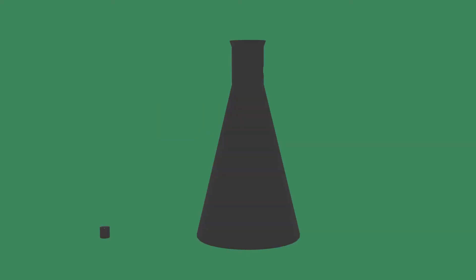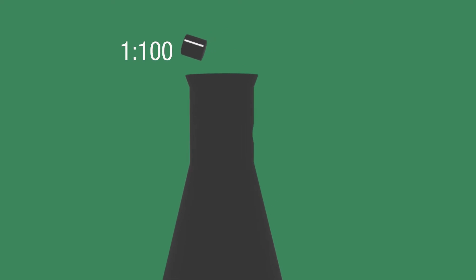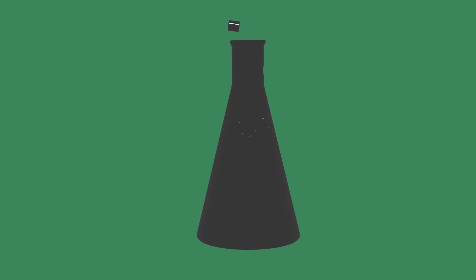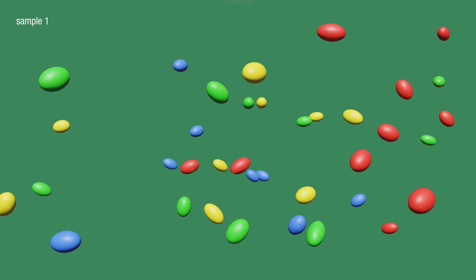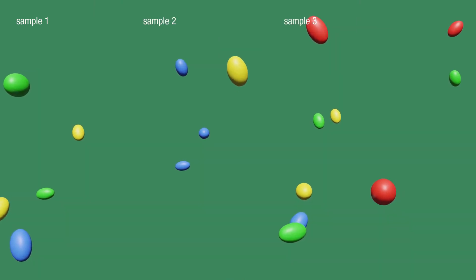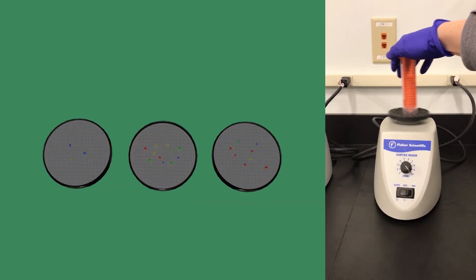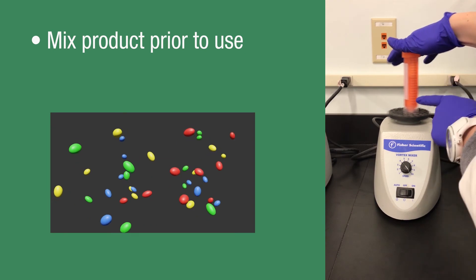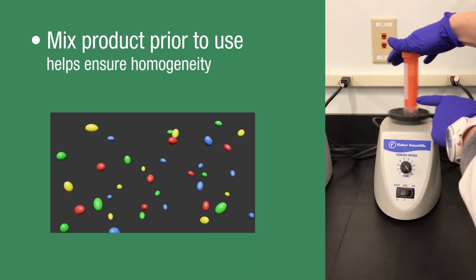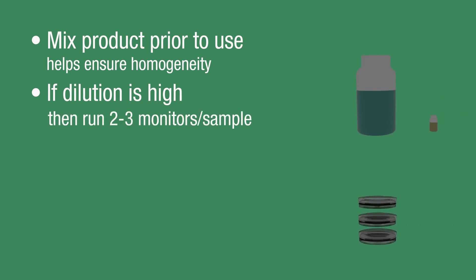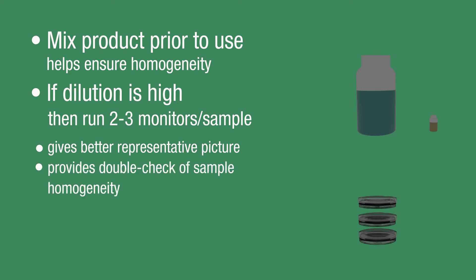A note of caution when using dilutions: testing small amounts of sample in large amounts of sterile buffer, such as 1 to 50 or 1 to 100, is possible and might even be necessary. However, increased dilution makes ensuring a representative sampling more difficult. Here's an example of how plates can vary if a sample isn't homogeneous. To address this potential issue, it's best to mix the product prior to sampling to make sure it is well homogenized. If using high dilutions, running 2 to 3 monitors per sample gives a better representative picture and provides a double check of sample homogeneity.